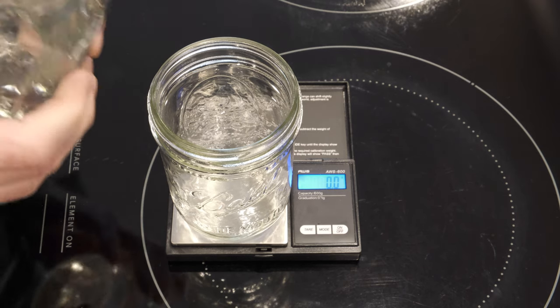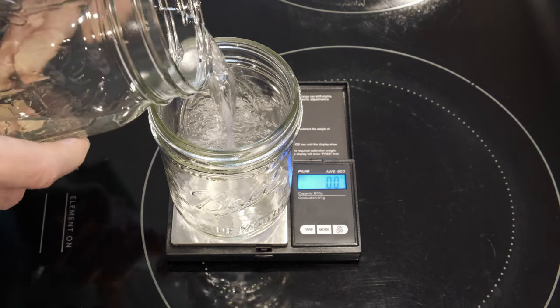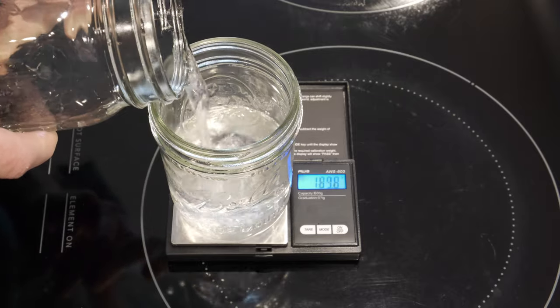I've heard anything from 2% up to 10%, so I decided I would do some testing to figure it out. Let me show you what I did. I started by filling each of my glass jars with 300 milliliters of water.